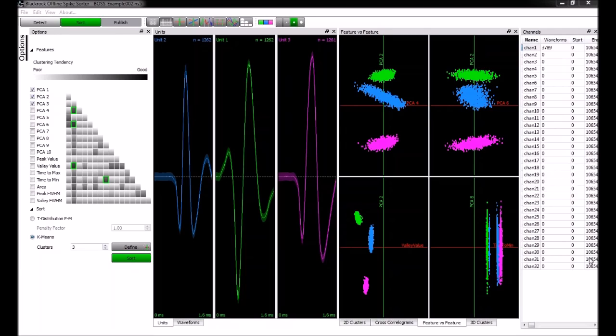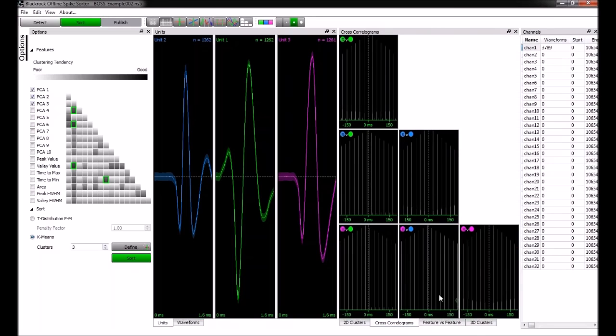There's some good questions coming up. The question was, can you add an autocorrelogram feature to sorting? And the answer is basically yes. It's already there in version 1.1. If you happen to download the older version before, there was a new version released today. So just go to blackrockmicro.com/boss to download the new version.